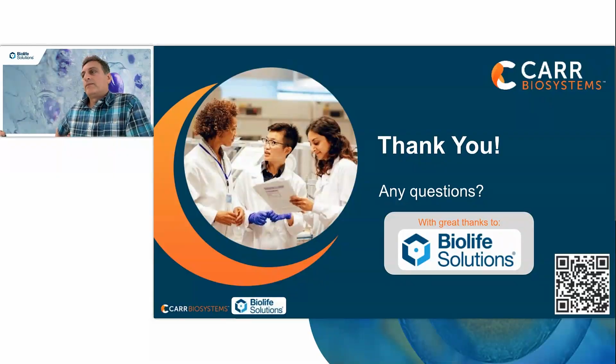So obviously, we'll try to replicate this. This is, I think, fairly comprehensive. The only thing that we didn't really try in this one, and it really didn't pertain to the fresh versus frozen leukopak, was the functional assessment of the cells post-thaw on the final drug product. Additional tests that we can do are cytotoxicity and killing assays, but that really doesn't speak to how the cells are generated up to the point of harvest.